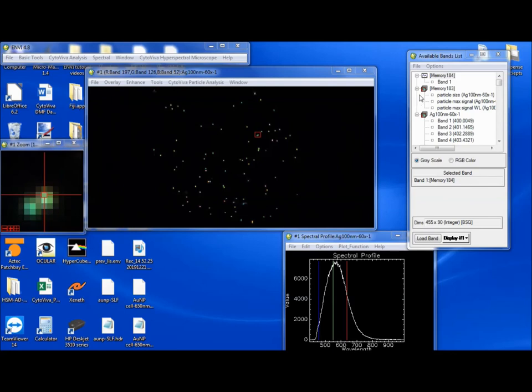Well, that concludes the tutorial on using the particle filter tool. Thank you.